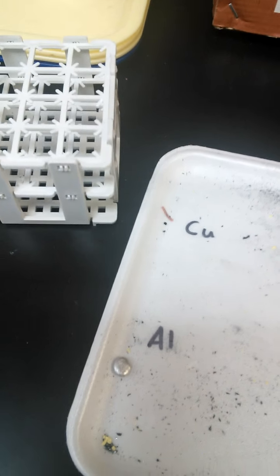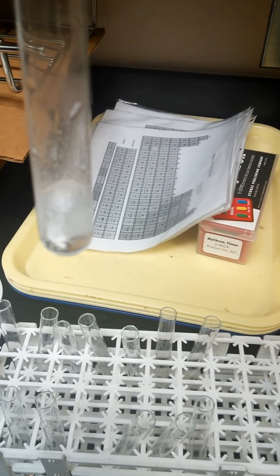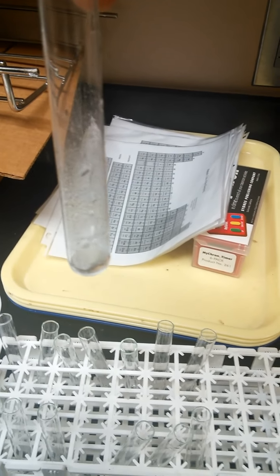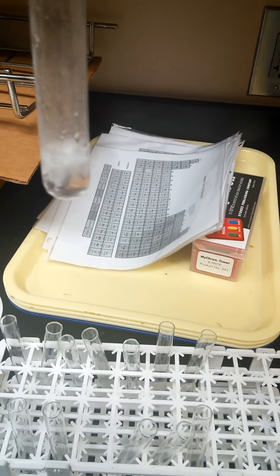So our next element will be magnesium. And as you can see right there, magnesium is creating a lot of bubbles when it reacts with the hydrochloric acid. So magnesium does react with hydrochloric acid.